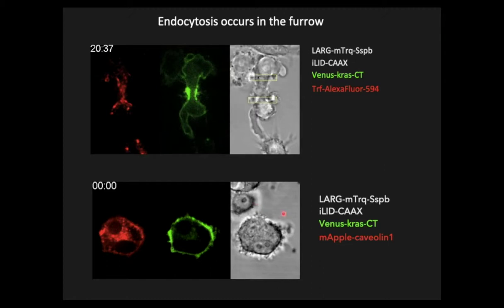In the second movie, we use another endocytic marker, caveolin, which is a membrane protein, one of the principal components of caveolae membranes, and is involved in receptor-independent endocytosis. I mean, it's a different endocytosis mechanism, independent of clathrin. In red is caveolin in the second movie, and the green is the membrane marker.